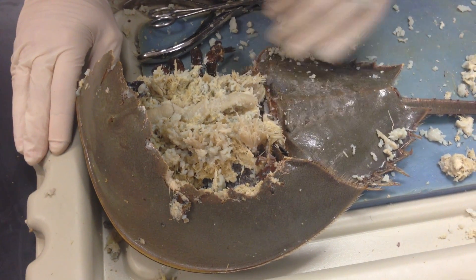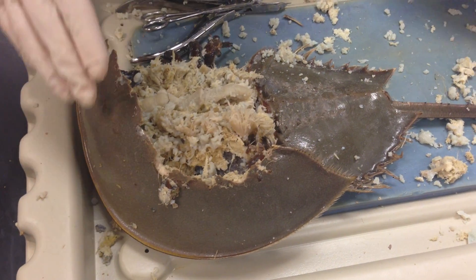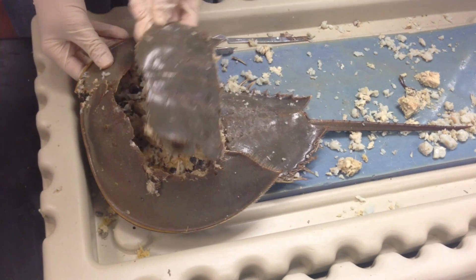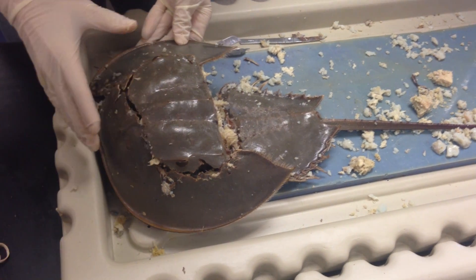What we're looking at is a horseshoe crab right here, and what we've done is we've cut it open a bit. We're going to reassemble what you're looking at and give you an idea of what all the structures are.